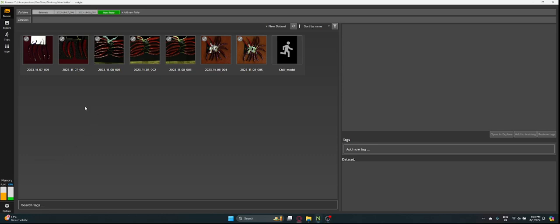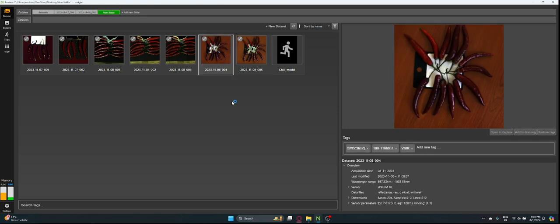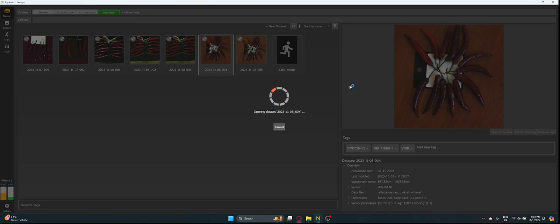Okay, so now we are going to use the Spectrum Insight software. I have a few examples here, which are sampled from Mardi, Chile sample. So in fact, okay, just to show you.